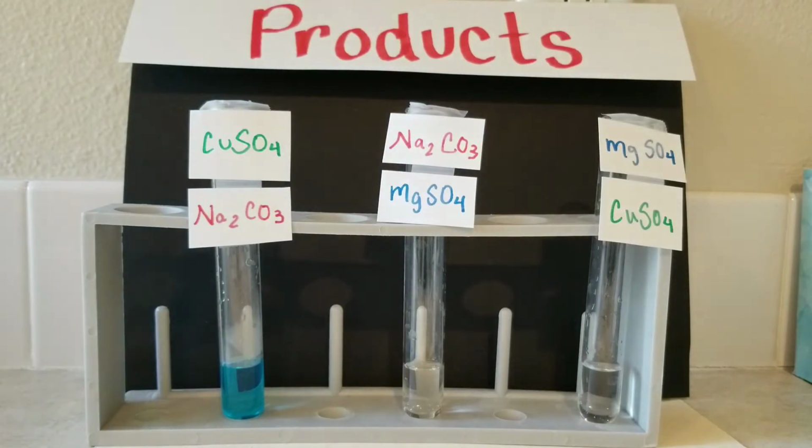So the first one, we're going to go back to the sodium carbonate, and we're going to add some to the test tube there, and the second with the magnesium sulfate, and so on. So we started at the blue end. This time we're going to start at the opposite end. So we've got our magnesium sulfate in there. We're going to add in our copper sulfate.